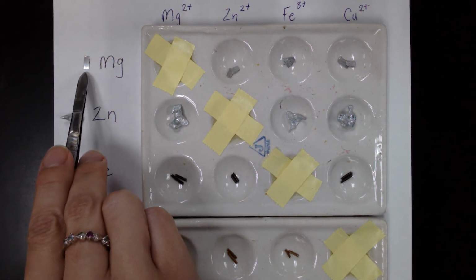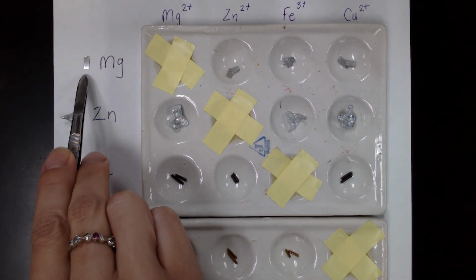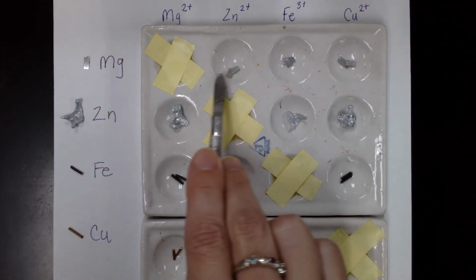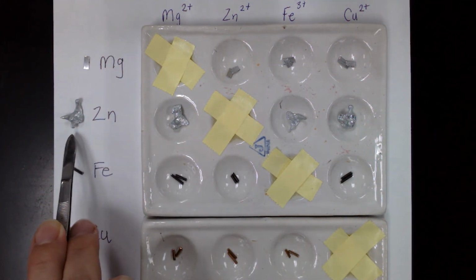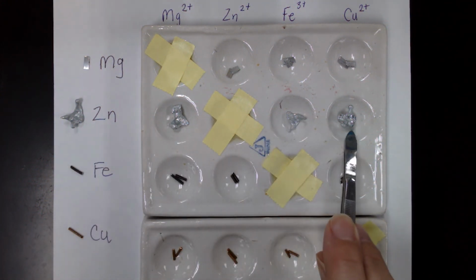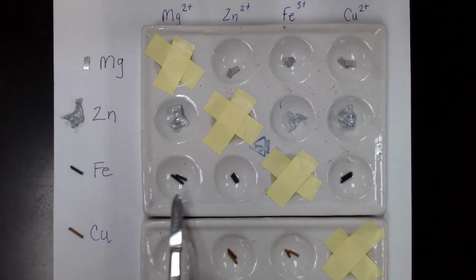So our solid magnesium, for reference, is right here. So all across this row, we have the magnesium pieces. Zinc has kind of a fun shape. Here's zinc and our zinc metal. Iron with our iron metal, and then finally copper with our copper metal.